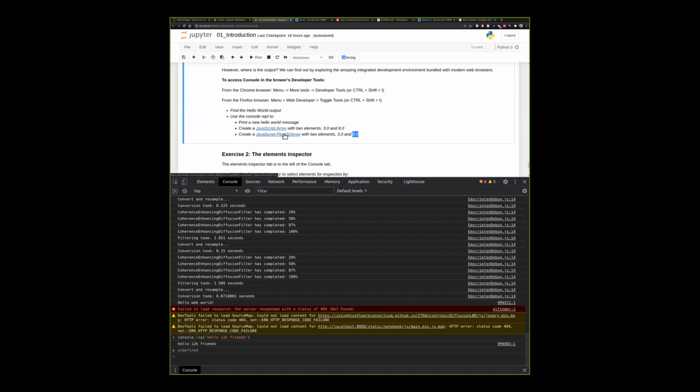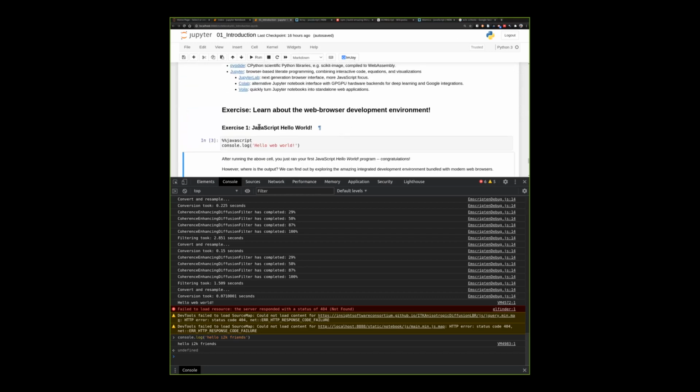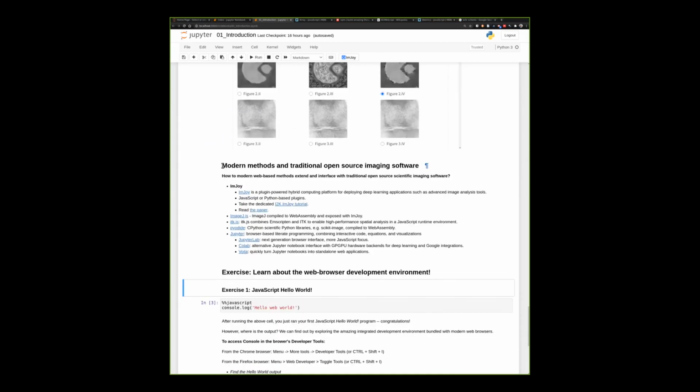So sorry, are we supposed to have these exercises in our notebooks? Because mine stopped after the denoising. Yes, you do not have this content here. It goes through the GitHub denoising part and then it just stops. Did I do something wrong? Do you have this content in your notebook? No. No? Sorry, am I the only one? I just downloaded it from GitHub.